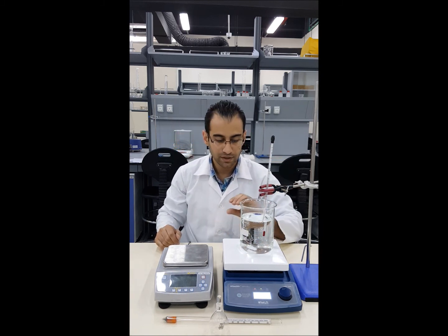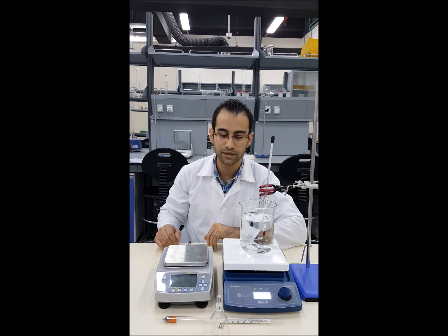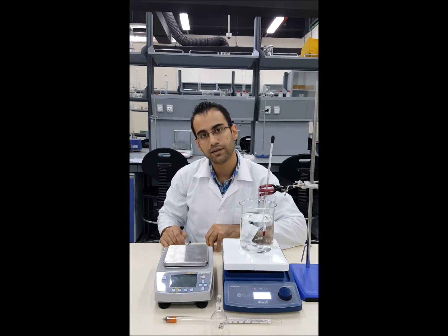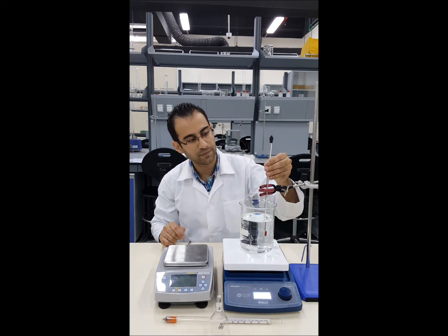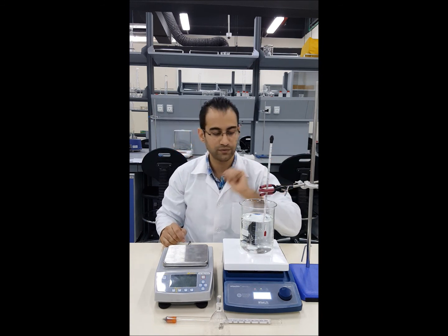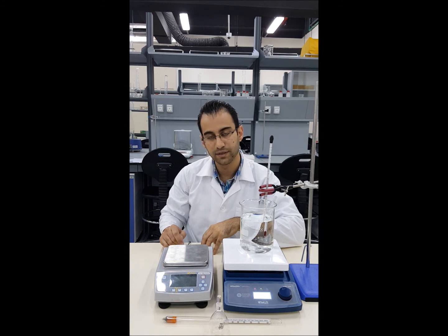Whenever we reach the required temperature we take a density reading using the density bottle and the hydrometer. For example, if the temperature is currently 44°C, we wait until it reaches 45°C and then take the density reading.